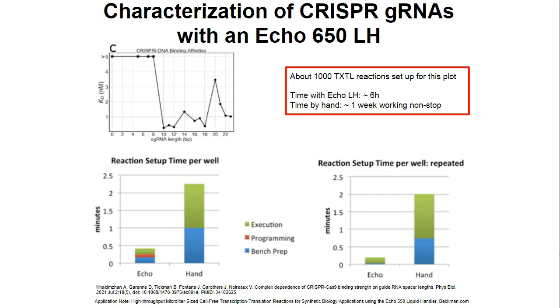Now with a liquid handler, I remember this took me, I did it within a working day, so about 6 hours. And if I had to do all these experiments by hand, it would take me probably about a week of just working nonstop, going in and doing reactions every day.